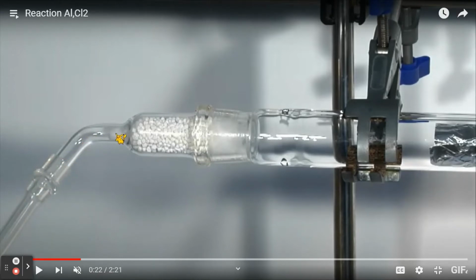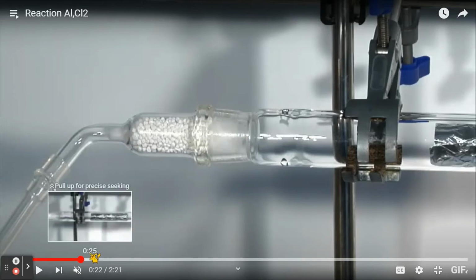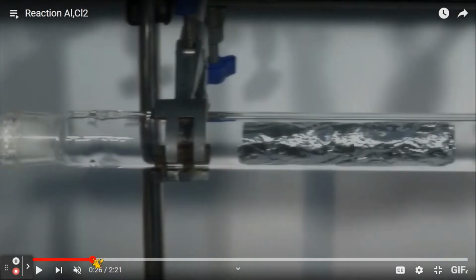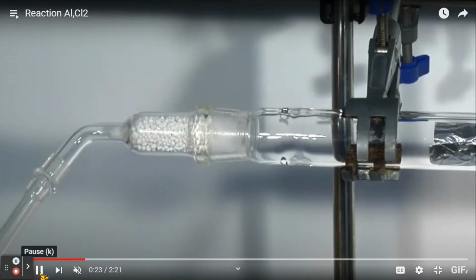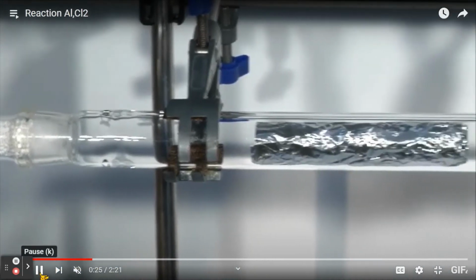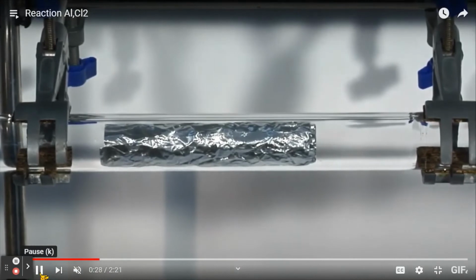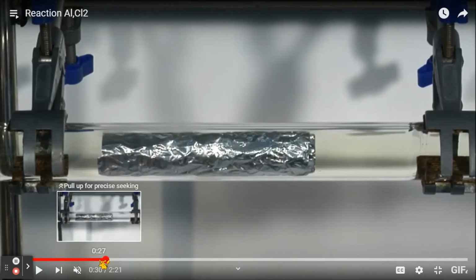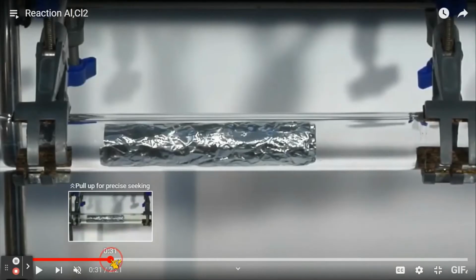So your chlorine is going to be coming through, and this is another reason why you probably haven't seen it in school: this kind of setup is particularly risky, particularly dangerous, especially due to the risk of the chlorine. So let's just play the video and see what's going on. So you've got the aluminium foil there. Now the video jumps forward, and you've now got chlorine going through. So there's a before, okay, and there's an after.